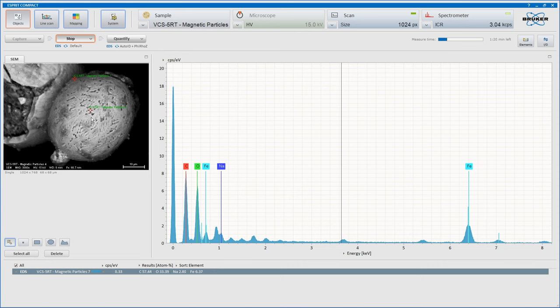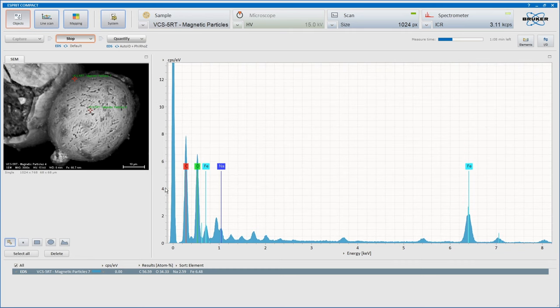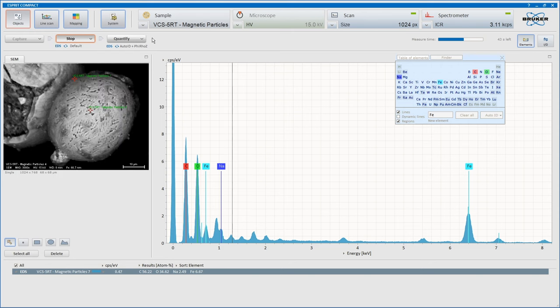So that's interesting. It is a different element, but it's sodium. It's seeing there. So actually, it's got a lot of different peaks. Why is it not detecting everything else? Let me see what's going on here. Have I got fixed elements? It's auto-detected those elements, but there are definitely other elements here. What are they? What have I actually got this on? I think I need to do some quantify here. There's definitely other elements here, I would argue.